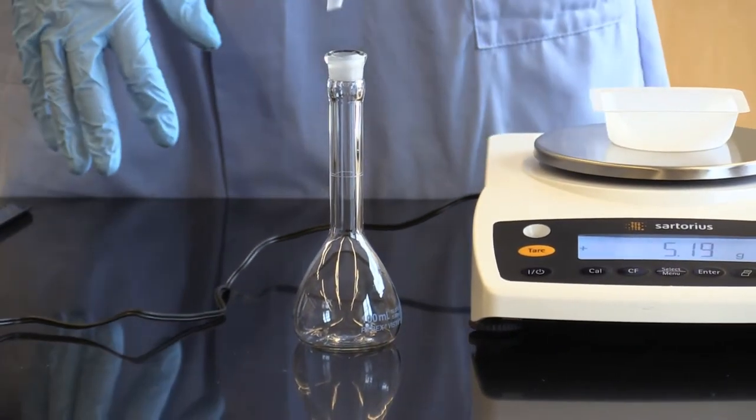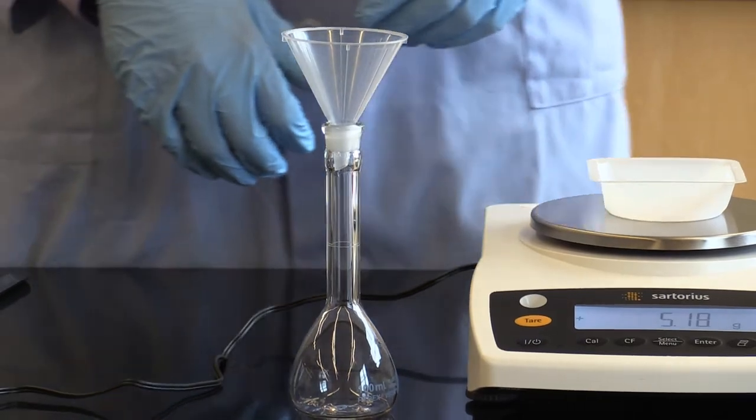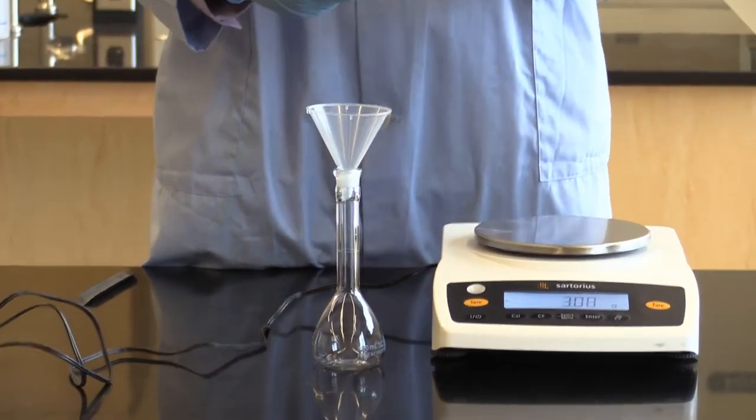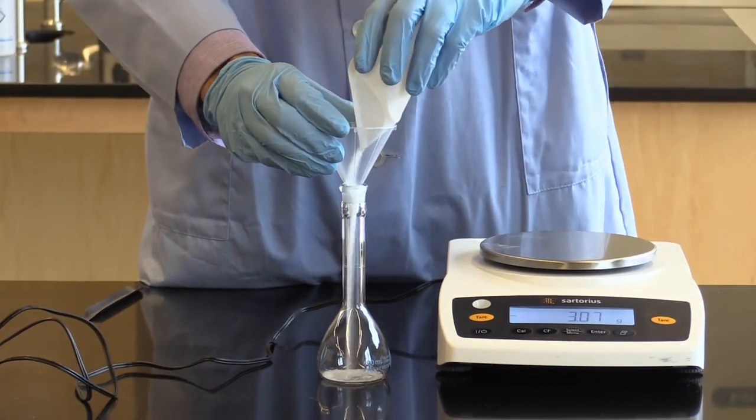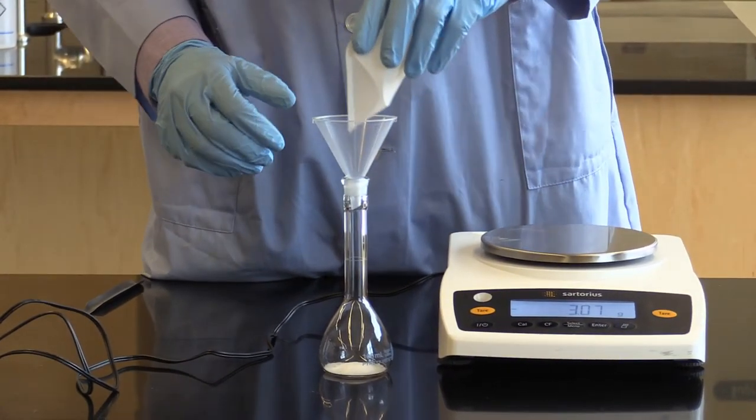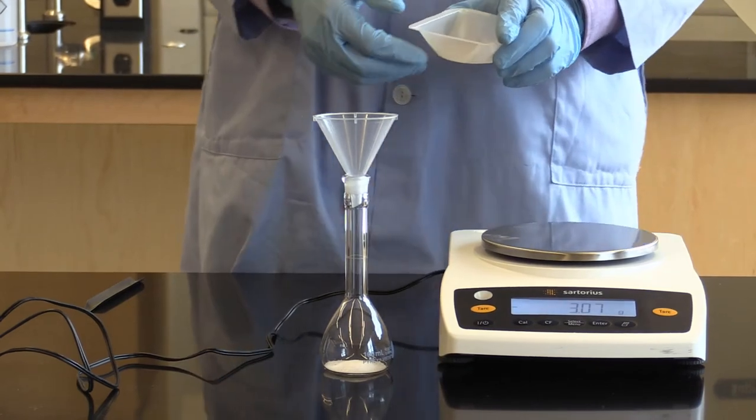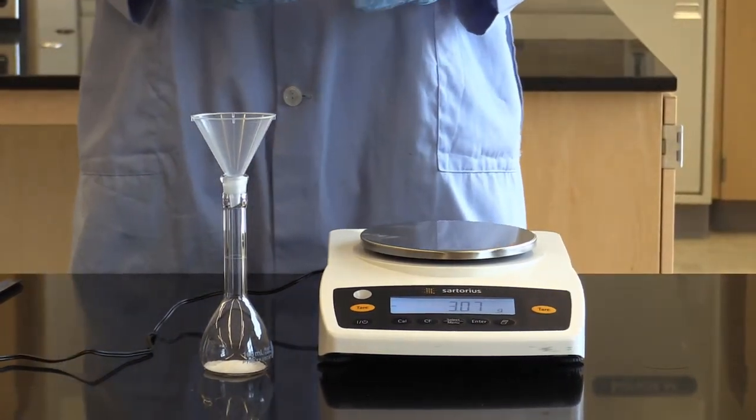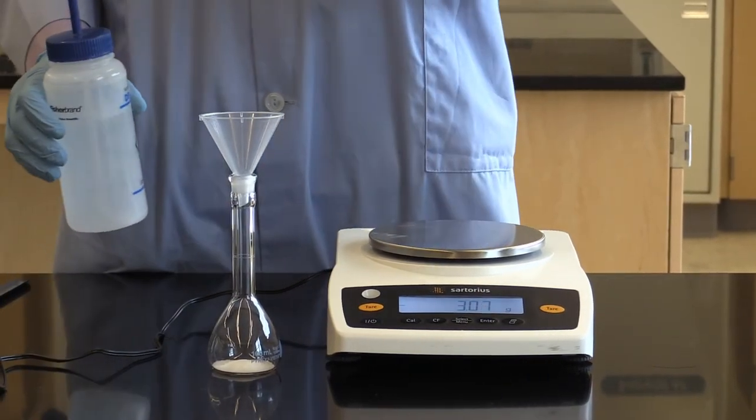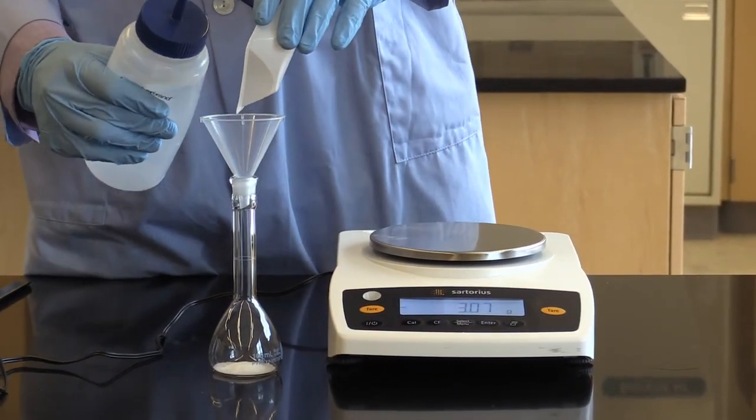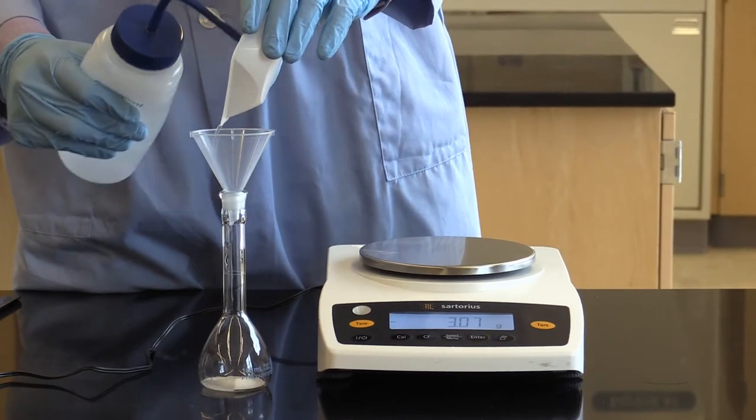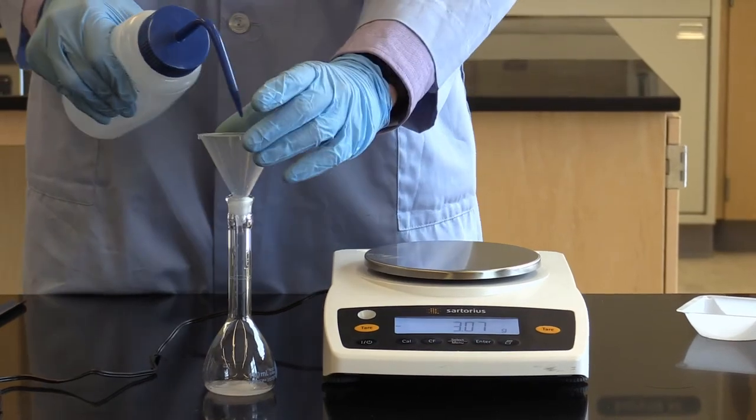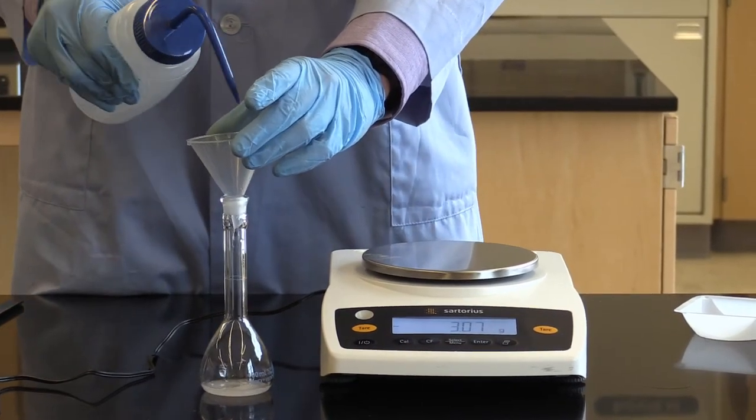So we're then going to place a funnel on top of the flask, and then we are going to pour our sucrose in. Next what we want to do is dissolve the sucrose before bringing it up to 100 mils. So to make sure I got all the sucrose off the weigh boat, I'm going to wet the weigh boat. I'm then going to wet the funnel just to make sure I get all that sucrose in.